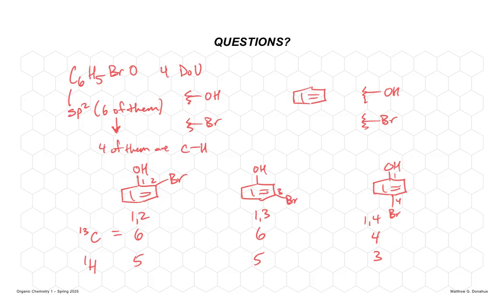So if we look at this hydrogen here, maybe I'll draw it in blue so it's different. That hydrogen, how many neighbors does it have? It has 1, so what should it look like? So I'm just going to write a little d above it.